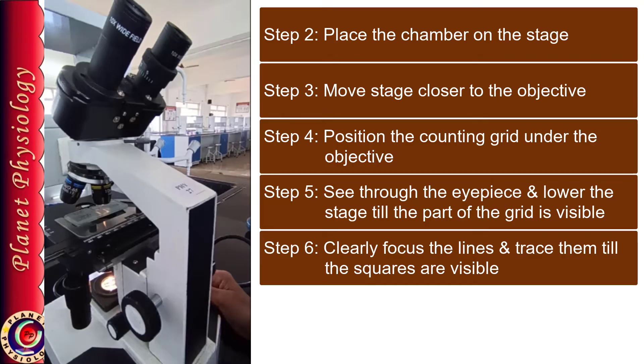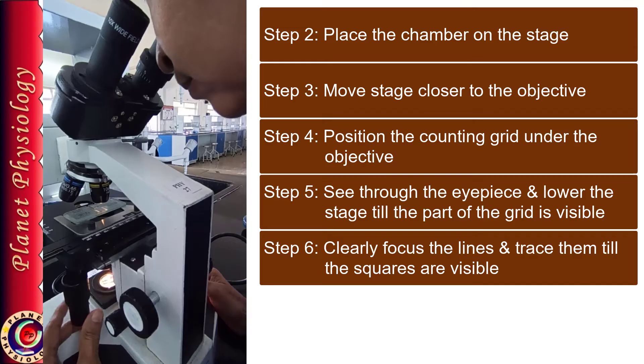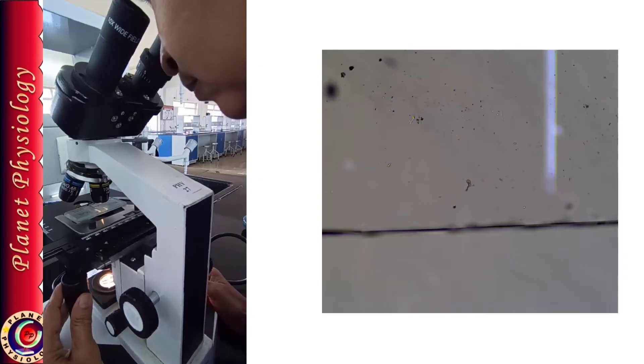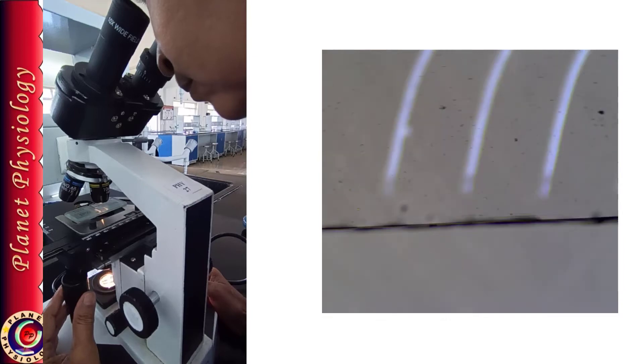Now only use mechanical stage screws to move the chamber. Now how to move? Whatever lines are visible, we have to trace those lines till we get the squares.